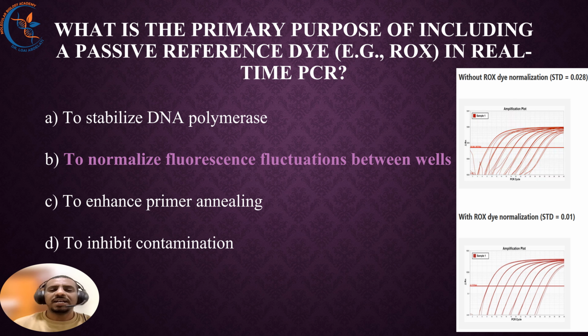Actually, ROX dye provides a stable baseline fluorescence, helping to correct variation in reaction volume and instrument optics between wells. This ensures consistent and reliable measurements, okay? It does not stabilize enzymes in option A or interact with the primers in options C and D. All right, let's move on.